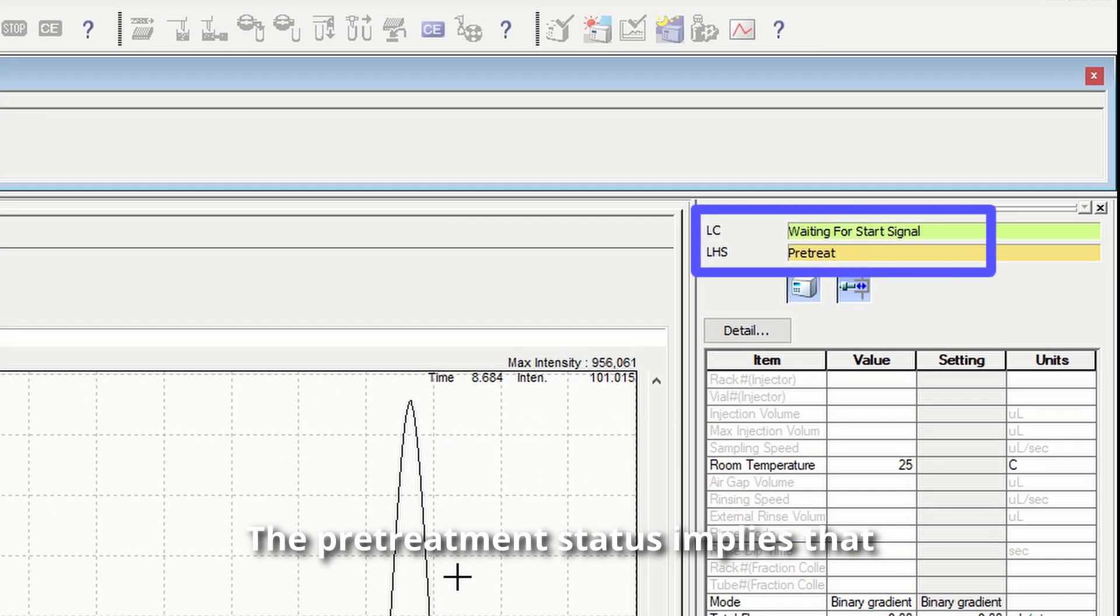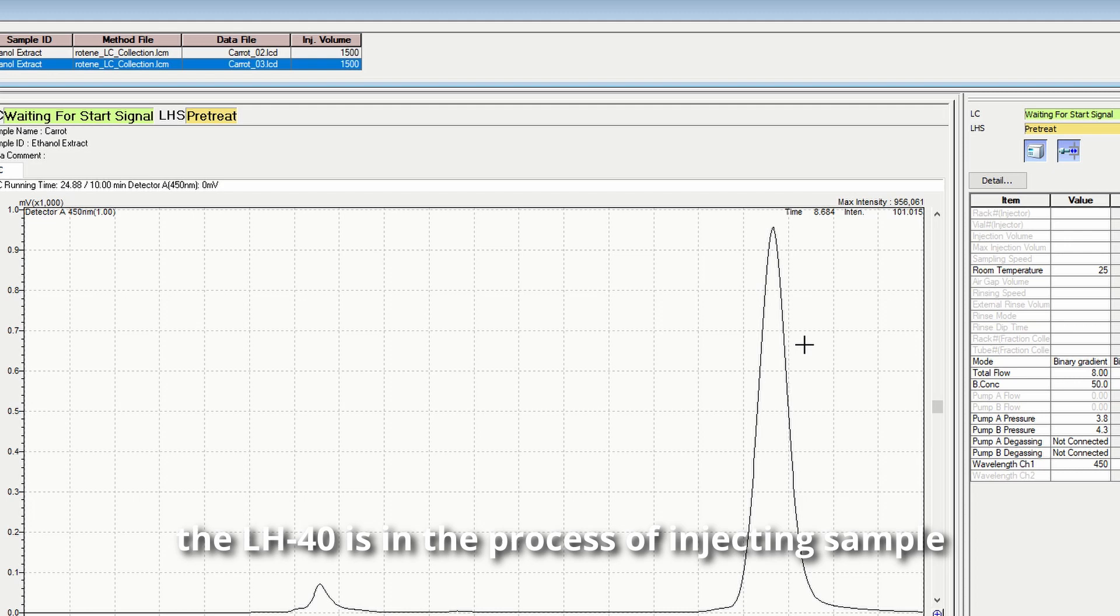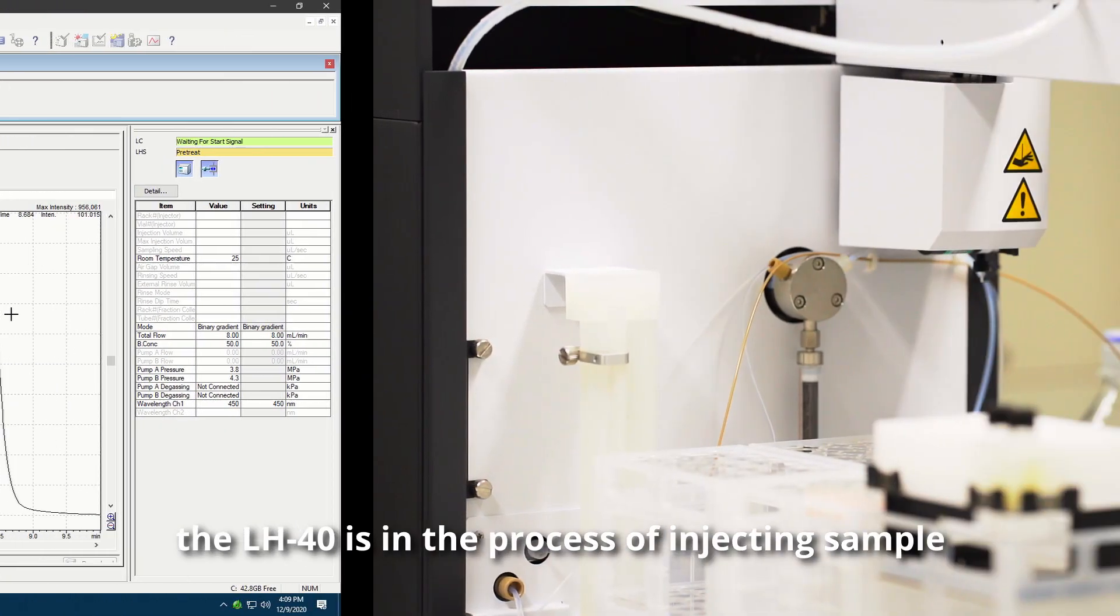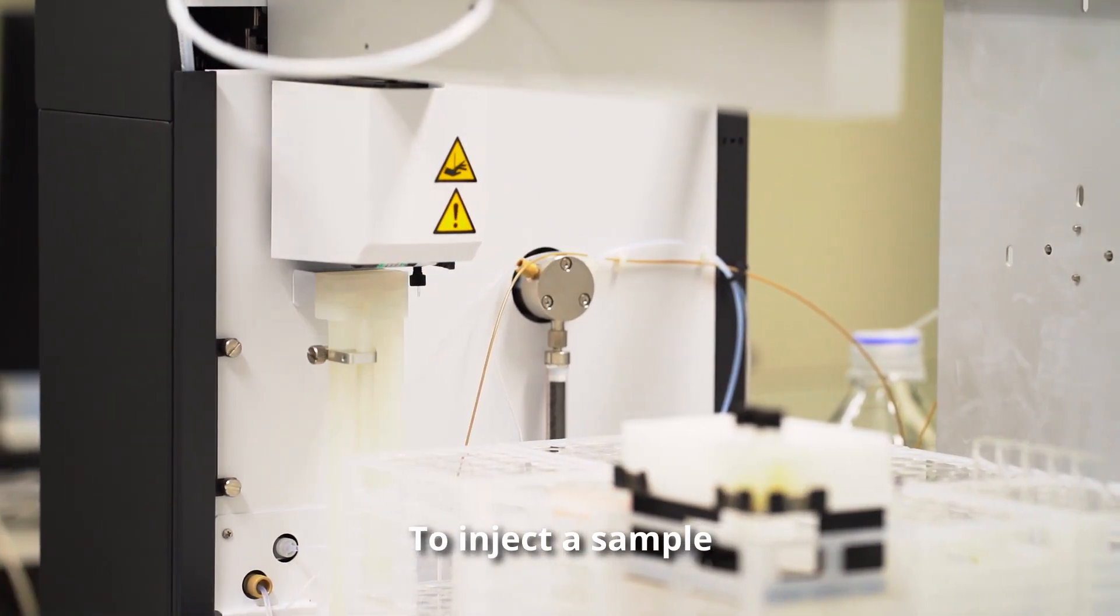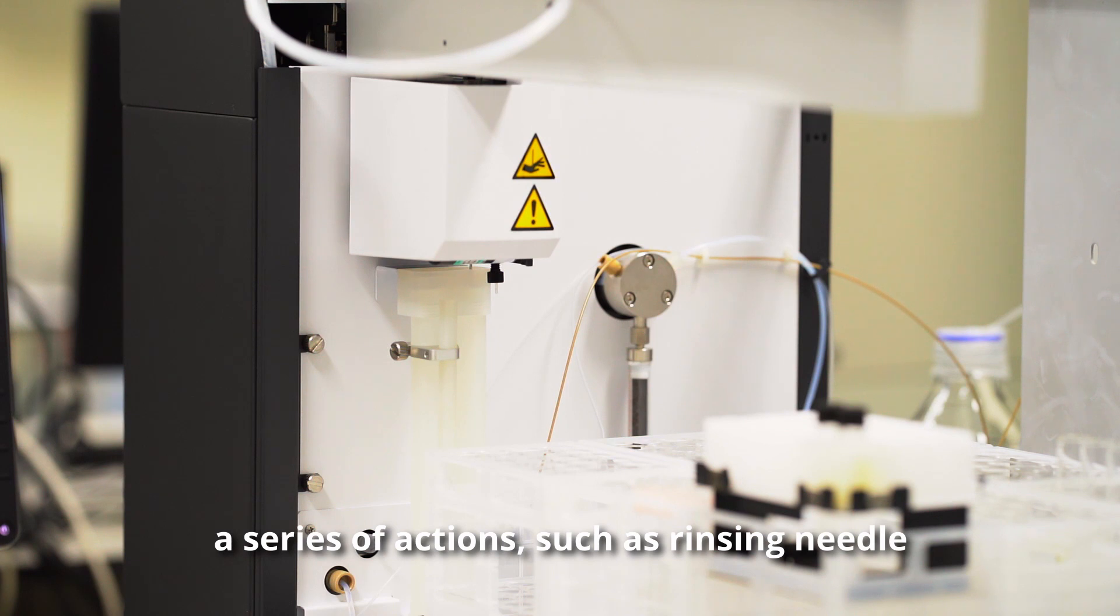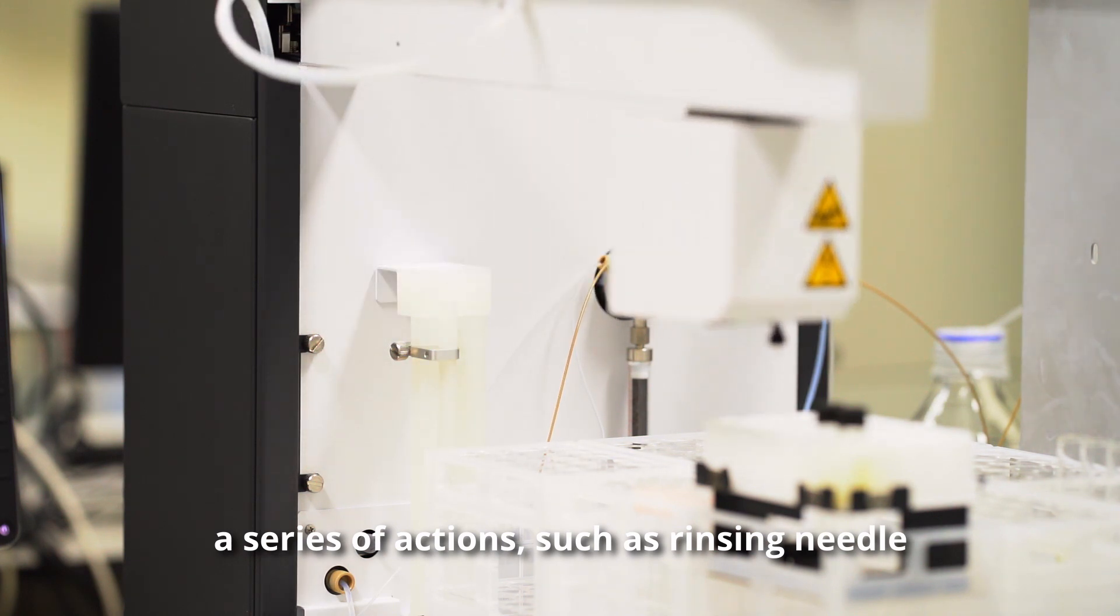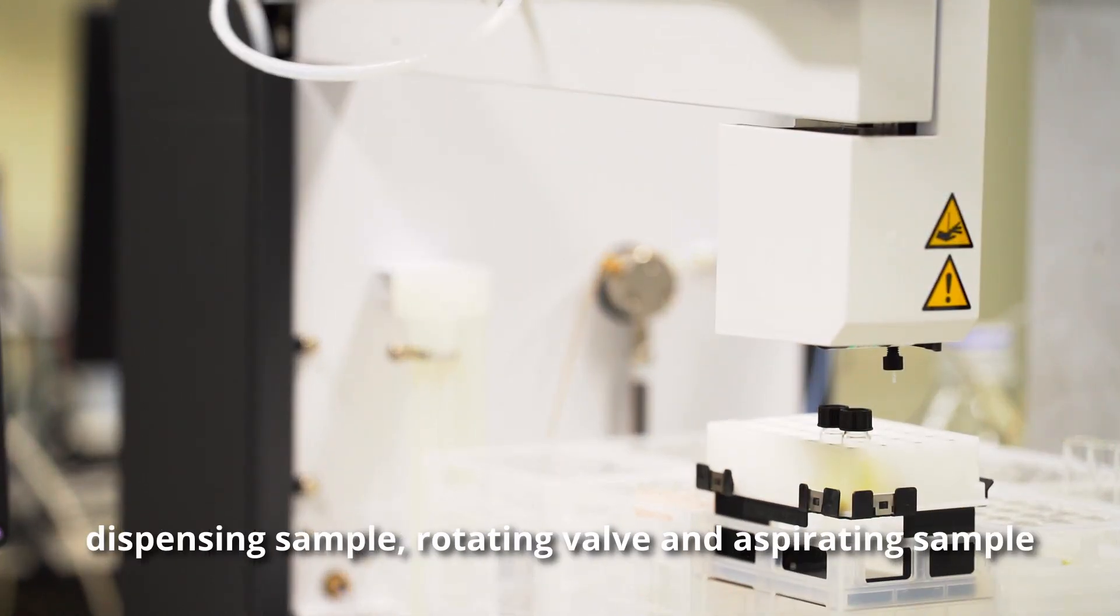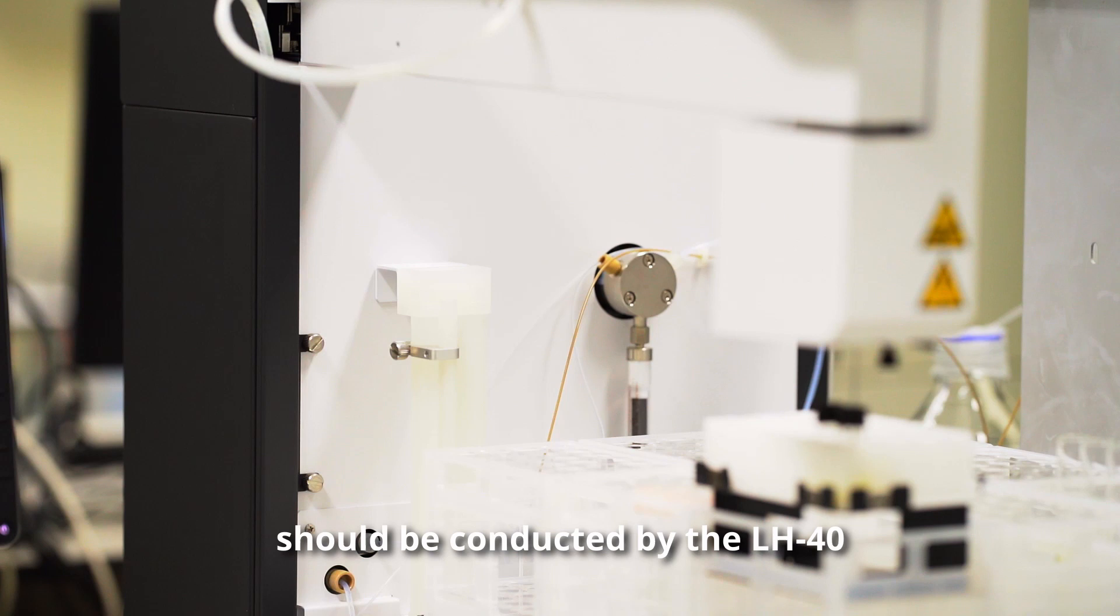The Pre-Treatment Status implies that the LH40 is in the process of injecting sample. To inject a sample, a series of actions such as rinsing needle, dispensing sample, rotating valve, and aspirating sample should be conducted by the LH40.